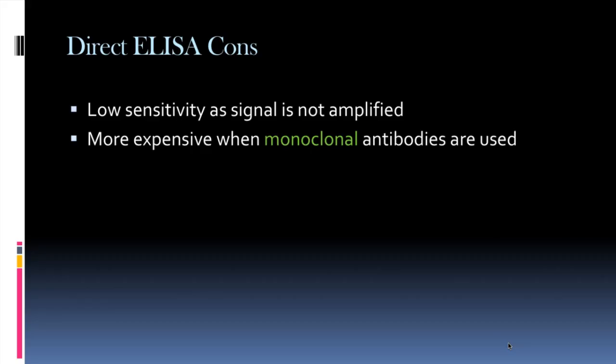And so because of this, you don't have the opportunity for multiple antibodies binding and giving off a signal, which means you get a very small signal released for each antigen that is detected. When you use additional antibodies, you can have binding to multiple different sites, and that can give you a lot of signal amplification for one signal or one antigen.